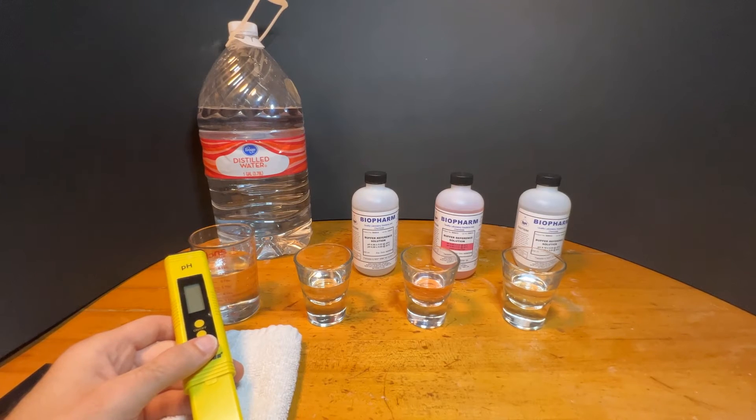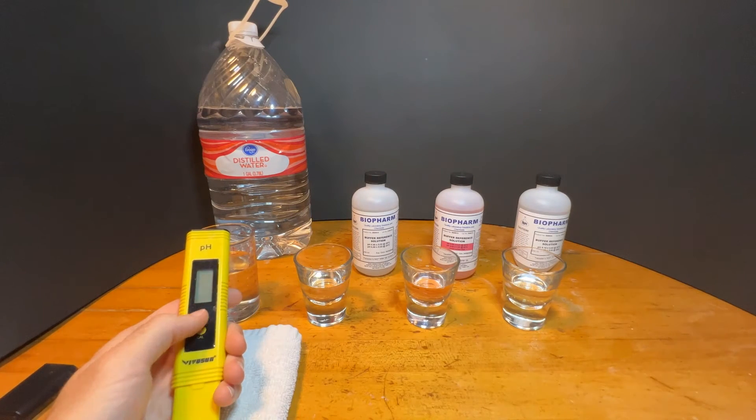This also brings the added benefit of knowing when to calibrate again. As soon as the meter starts to take longer to settle on a PH, you know it's time to calibrate. Let's do the three-point test.